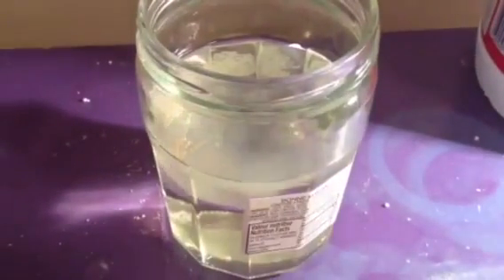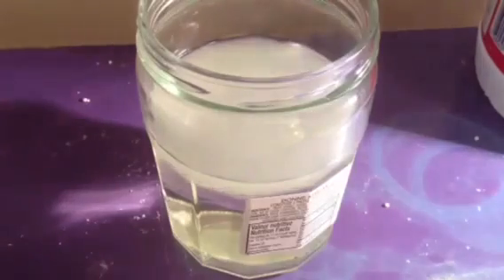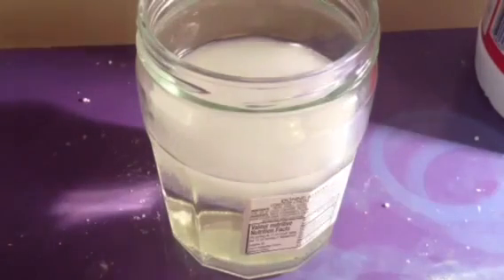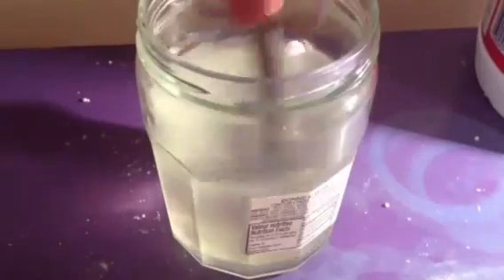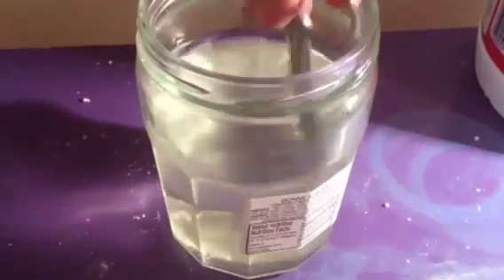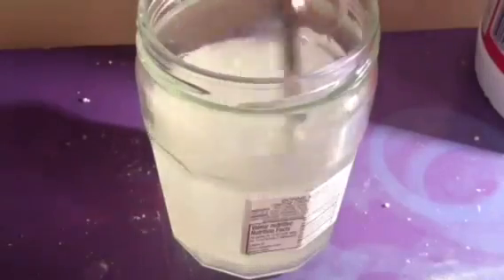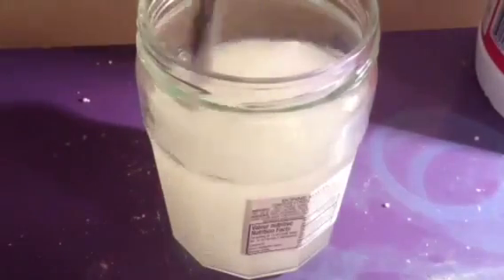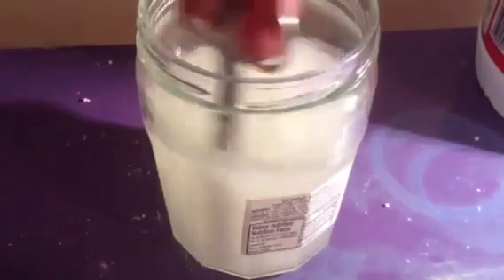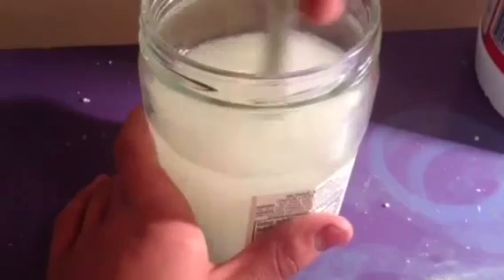Put that in there. As you can see, it's actually turning white. Now just mix this easily — you can use anything to mix it. Let's give this a mix. And it turns white. It actually does produce heat if you feel it; it does get warm.